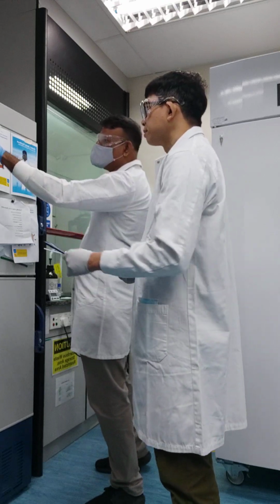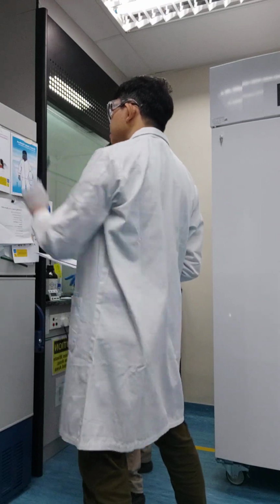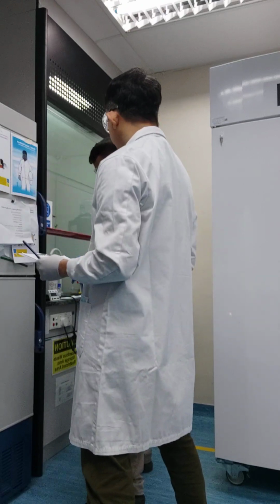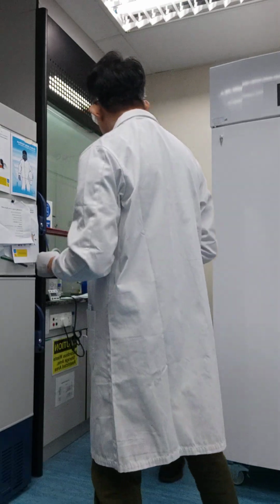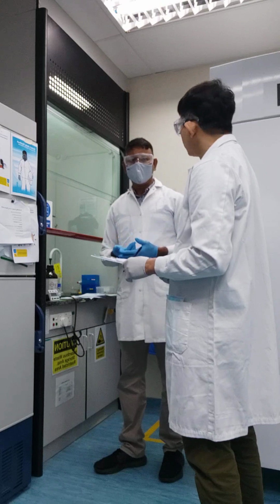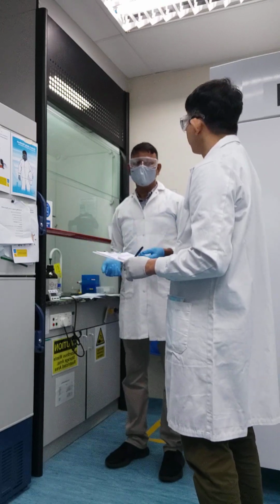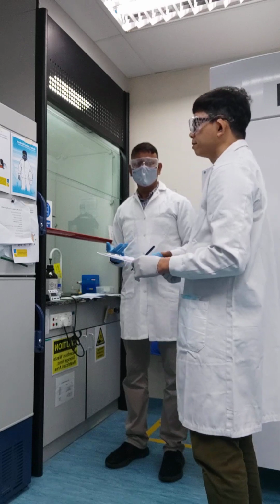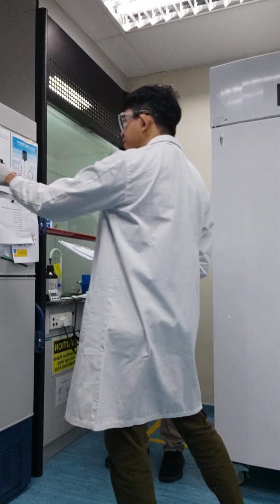So you need to look at the relevant information. So in this case, it talks about the corrosives and it talks about the irritant. So this is basically to help you understand the physical and chemical properties and what hazards it poses. Okay. Now I know where to look for the information, right? What the symbol means. Alright. Right. Now I know it.